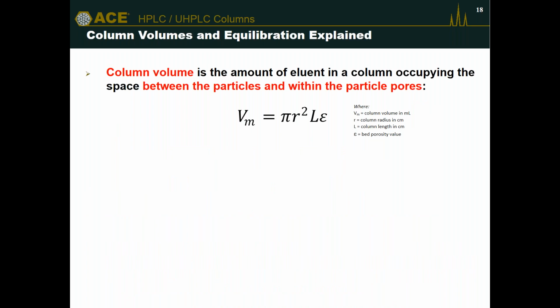So what do I mean when I talk about column volume? I've added these two slides in here because I think in column volumes all the time, because I'm dealing with columns all the time. But of course, in real life, people are thinking, how long do I need to equilibrate this column for? People think in minutes rather than column volumes. So what is column volume?